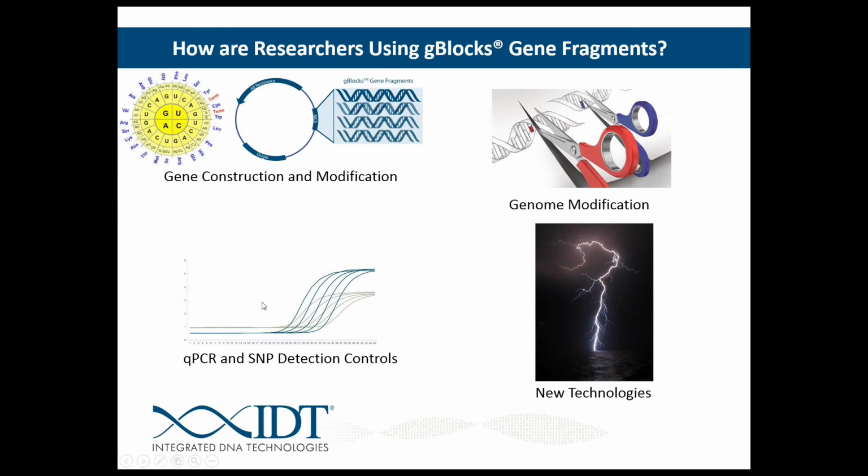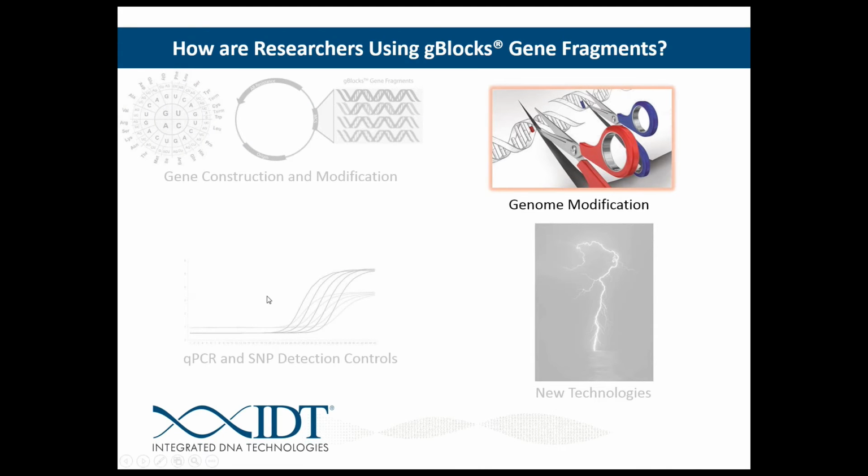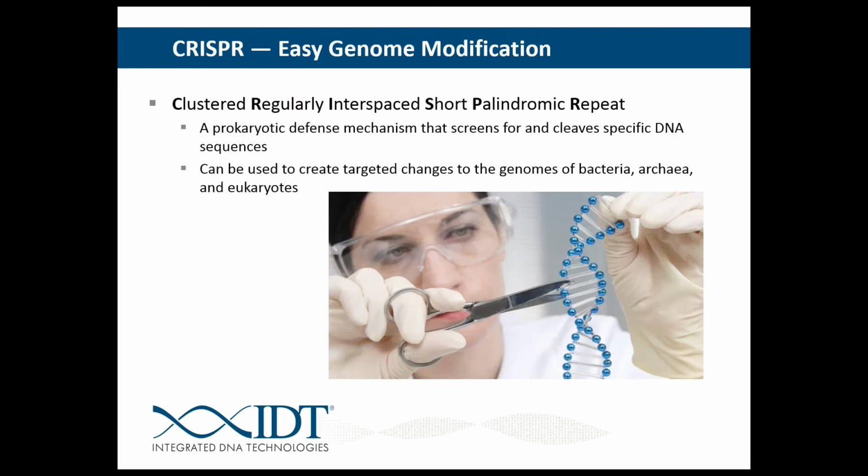Okay, so we've talked a little bit about gene construction and modification, and now I'd like to jump into another topic, and that is genome modification. And I think in 2013, one of the most exciting advances in the realm of genome modification was the utilization of CRISPR. For those of you not familiar with CRISPR, I'll take a minute to describe it.